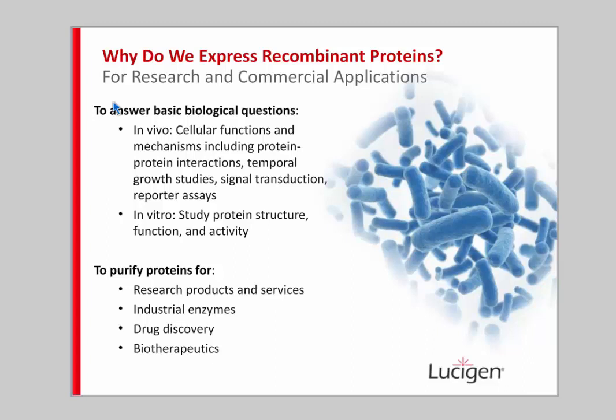And purifying that recombinant protein and studying it in vitro allows us to determine the protein's structure and to study, for example, enzyme kinetics or reaction conditions or reaction products. And we can also produce abundant amounts of the protein for use in biotherapeutics and industrial enzymes or for research products and services.